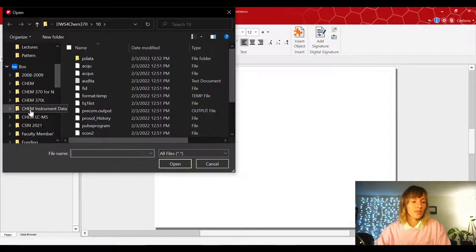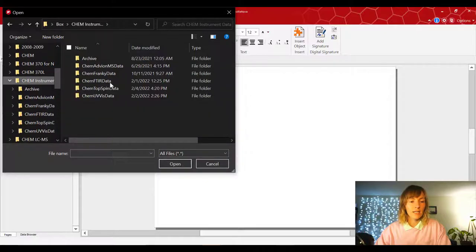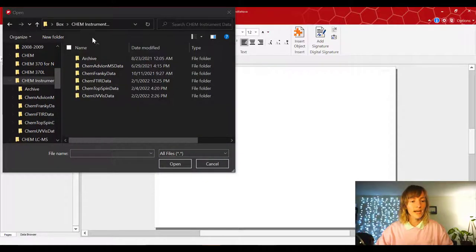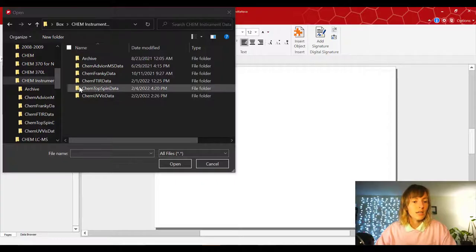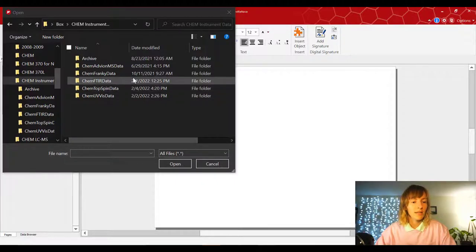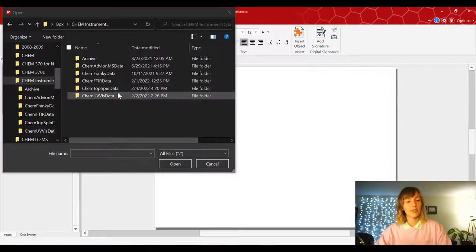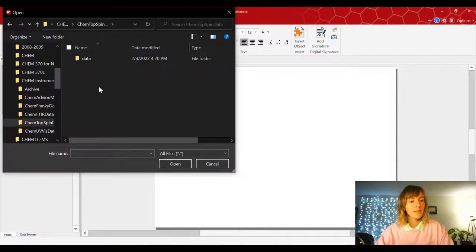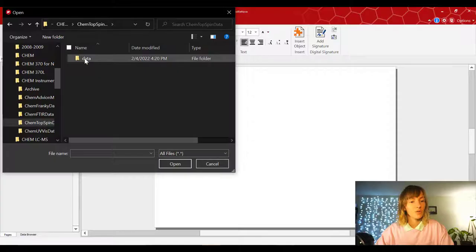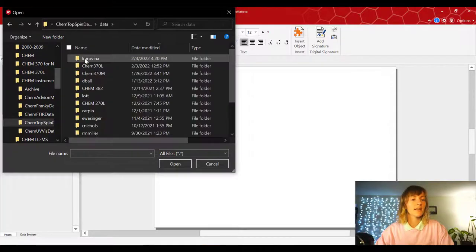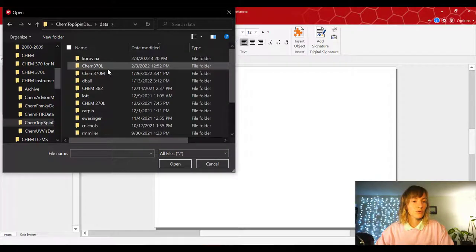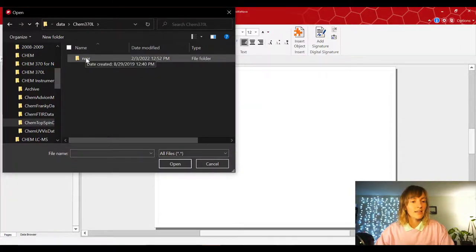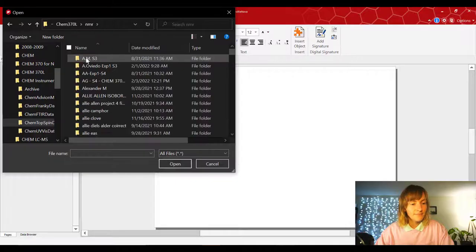So then you're gonna select the chem instrument data and, or if you only have access to the topspin and the FTIR separately, then just select the topspin data, then go to data, then go to chem370L, and select NMR.